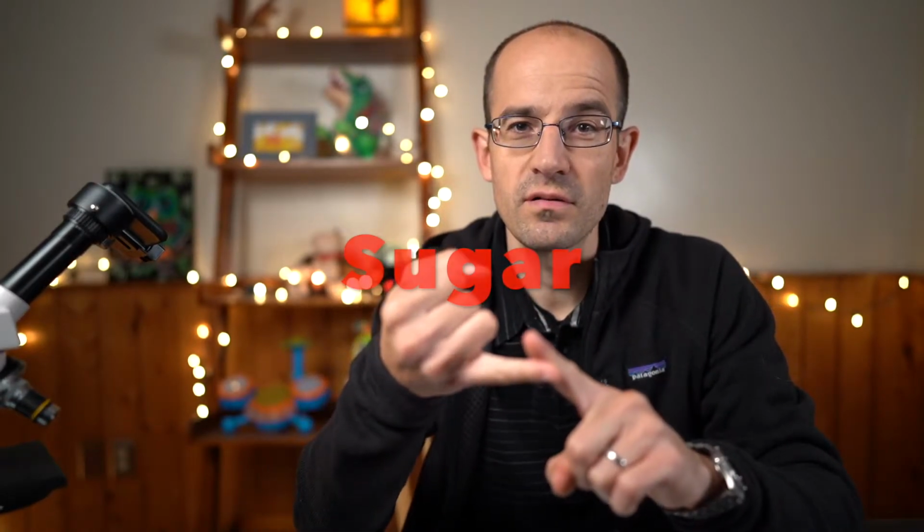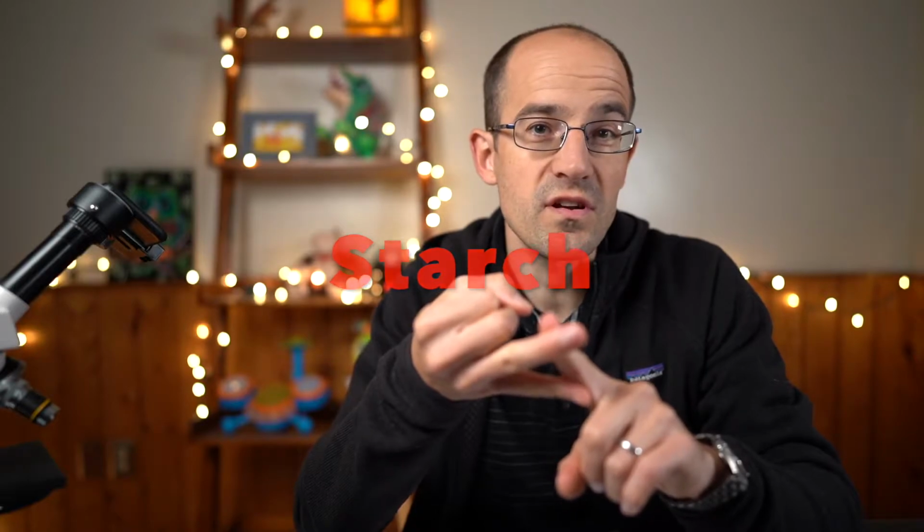Hello everybody. So today we are going to look at certain types of molecules that show up in biology and in living things. We've talked about water, we discussed cohesion and adhesion and surface tension, but now we're going to look at some more complex molecules, and the three that we're going to look at will be sugar, starch, which we've discussed with the dialysis tubing.